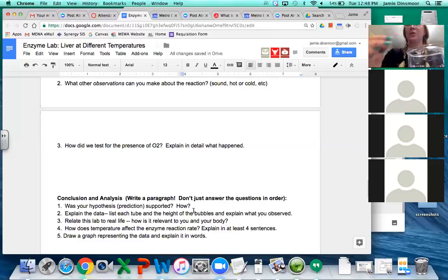Try a pencil. Nice embers. Actually, I thought about using a pencil. Do it. Ooh! Oh, I hear the pop. There's one right there. It happened. All right. So that's how we prove there's oxygen.